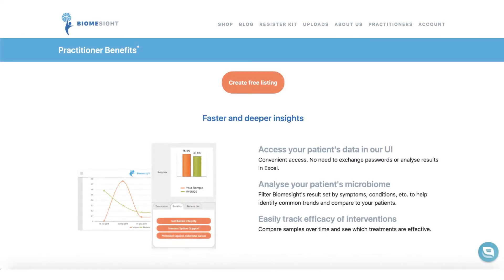Hi everyone, it's Ted Lawler from BiomeSight. Today I'd like to give you a walkthrough of the BiomeSight practitioner portal. BiomeSight has a free practitioner program which is suited to clinicians with experience and training in interpreting gut microbiome test results. Using the practitioner portal you can access your patient's health profile which includes diet and lifestyle as well as their microbiome results.